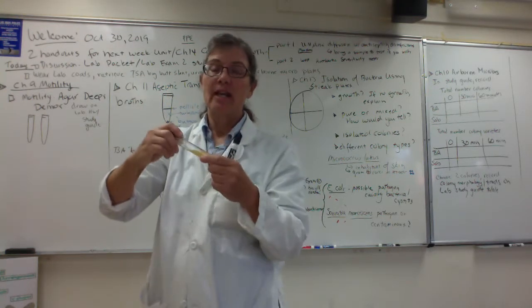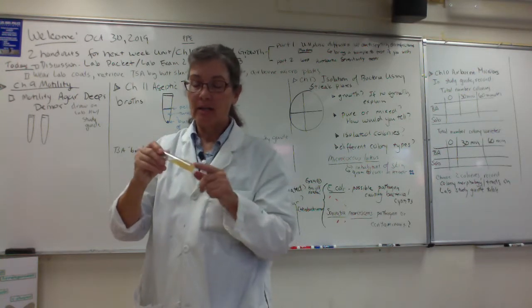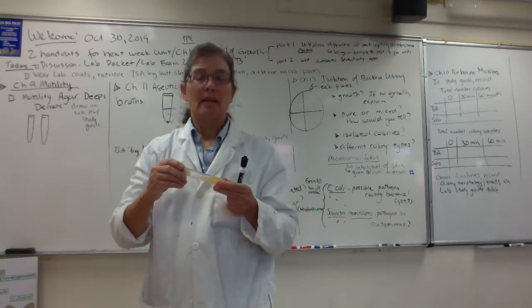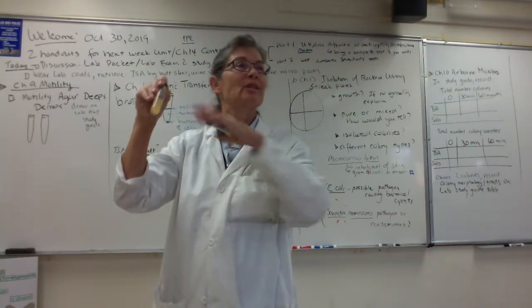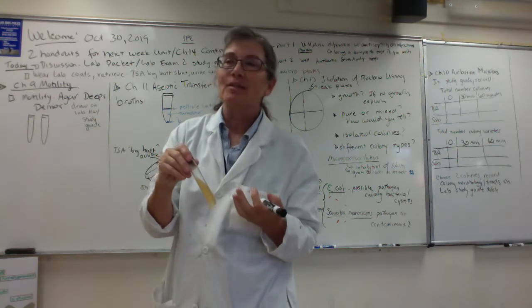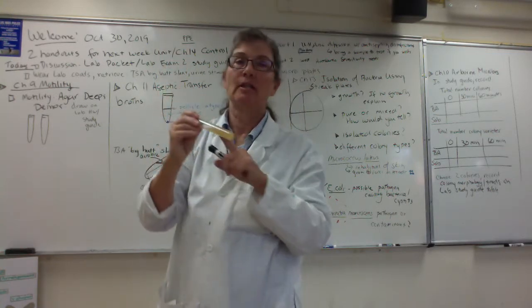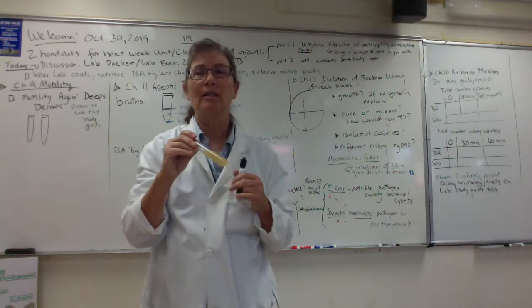Good job, you guys. We're just kind of learning this, looking at your big butt slant: can you tell if it's pure or contaminated? It's tough, you guys. If the growth on the surface looks the same, like the same kind of frosting, that's hopeful that you didn't get contamination. What if you saw non-pigmented colonies and maybe there are yellow or orange colonies in there? What would that suggest?